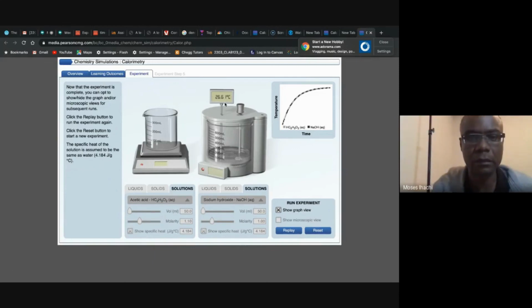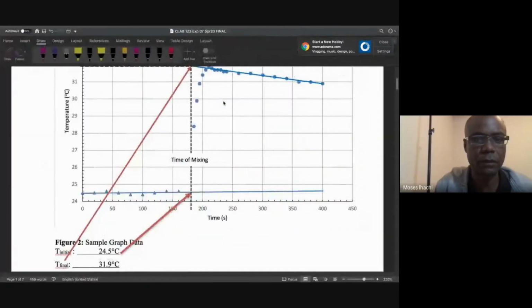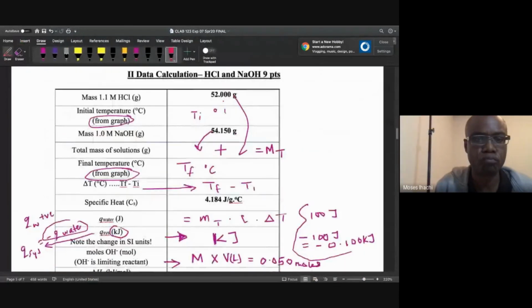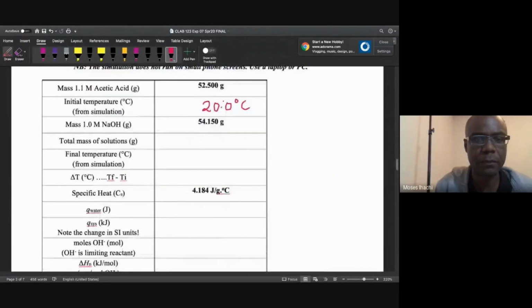All right, so that's the final temperature. The reaction is finished, 26.61. So I would come here. Where is the table?